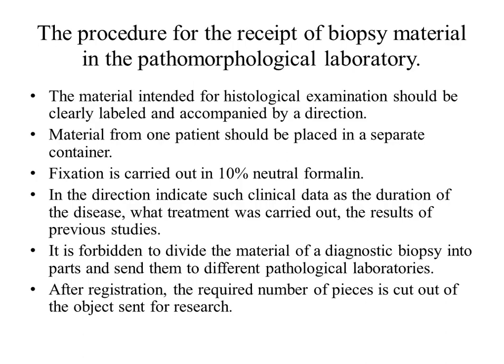Fixation is carried out in 10% neutral formalin. The direction indicates such clinical data as the duration of the disease, what treatment was carried out, the results of previous studies. It is forbidden to divide the material of the diagnostic biopsy into parts and send them to different pathological laboratories.